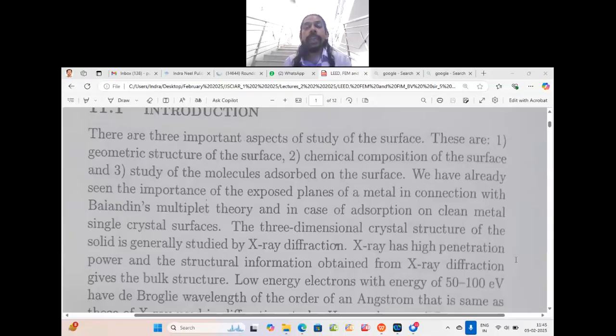Okay, going forward, all that glitters is not gold. We have to test if the material is indeed gold. As I told you, dear friends, electron spectroscopy is different from electronic spectroscopy. Electron spectroscopy means XPS, ESCA. In electron spectroscopy, photons are used as the source of excitation, the source of probing the material, the source of activation.